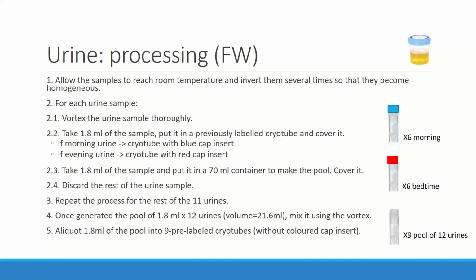Yeah, the cryotubes will also be bought centrally at ES Global. But again, you will need to keep some blanks. I have a specific slide talking about the blanks, which are the blanks we need for each sample and each lab. Okay, perfect. Thank you for saying it, because I think it's one of the most important points to track the background in each of the different recipients that we are using.